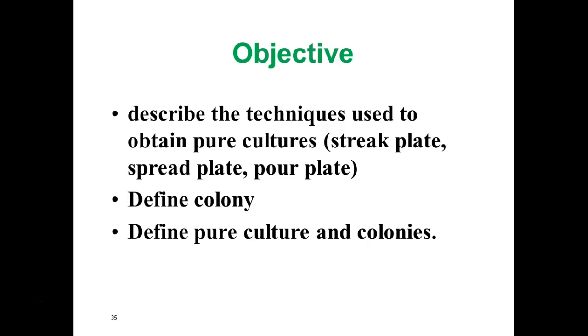In lab, students actually do these techniques, and we'll see one of them demonstrated today. You've already done streak plate. I'm going to demonstrate spread plate today and next week. We don't do pour plate anymore because it's not easy. But all of these can help us obtain what's called a pure culture.